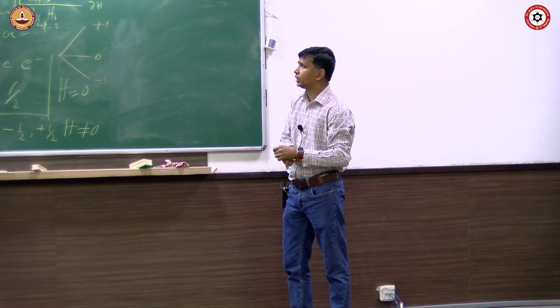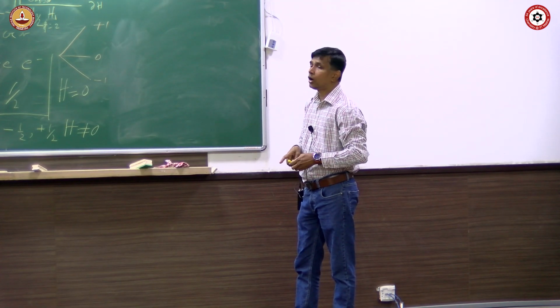Now we are going to what we probe about EPR.